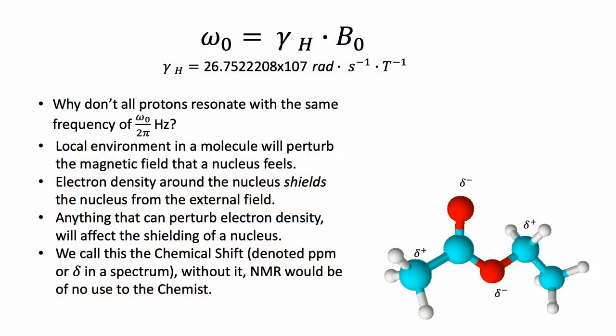But here's the equation for the frequency being proportional to the magnetic field strength. And you might think, okay, I have protons. Why don't I just get one peak because I have protons? I would have one peak for protons and one peak for other nuclei. If it did that, I wouldn't be up here talking to you about this, because while it might be a fine and dandy measurement for a physicist to use, it'd be useless for us in chemistry because we'd only get one peak for all the different protons that are in our sample.